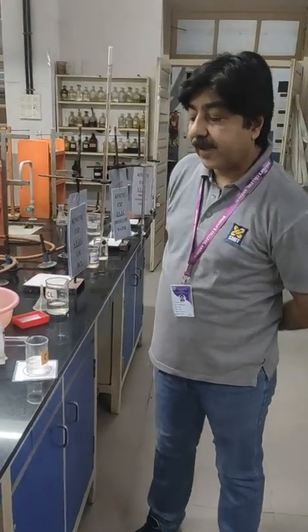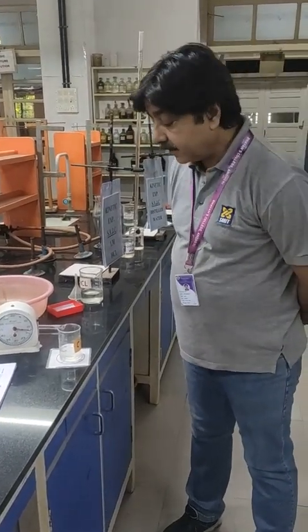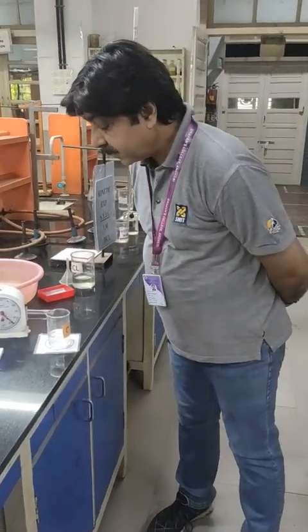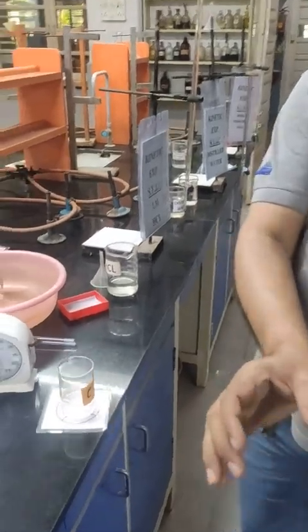Now again, as time passes, the sodium thiosulfate will react with HCl and it will produce colloidal sulfur, thus making this solution colloidal, and the solution will become turbid, which will result in disappearance of that mark which was distinctly visible from top of the container.